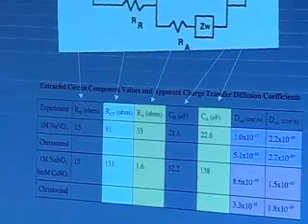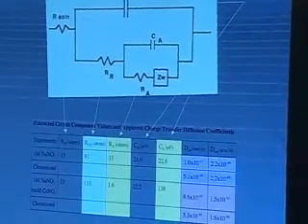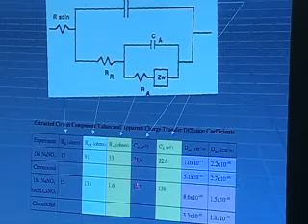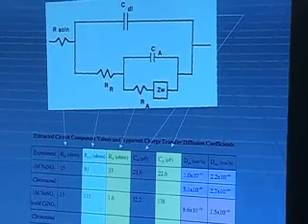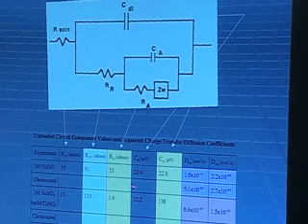We expect potentially some change in our double layer capacitance as we do this, but not a big change. That is, anything that changes on the surface can change the double layer. We're making a change on the surface, but we're not making a very big change. This double layer capacitance is a very sensitive parameter. And again, there is a little change there, but not significant. In fact, if someone said, you fit this wrong and these two numbers are actually the same, I'm sure there's another fit to this data that looks just as good as the one I just showed you that has these two numbers the same, I'd buy that also. We don't need this number for anything. This is just a check. If that number was fluctuating wildly, we would just throw out the fit. Okay? And then we have the capacitance associated with the ions moving in and out of this double layer. We expect that to have a big dependence. It does. Okay, so the model seems to meet reality pretty well.